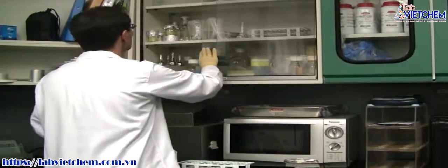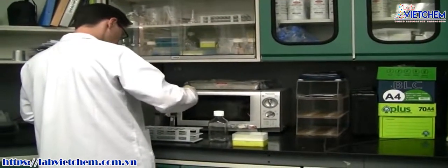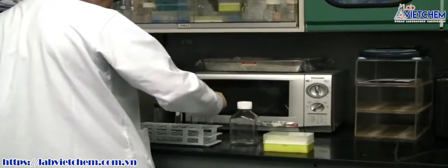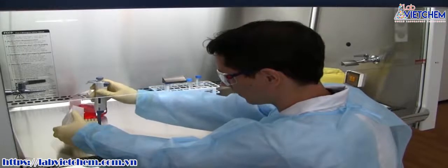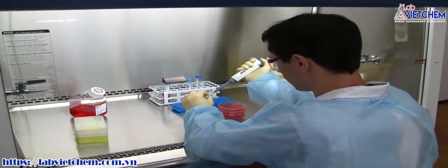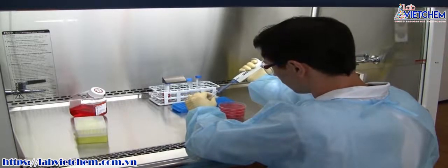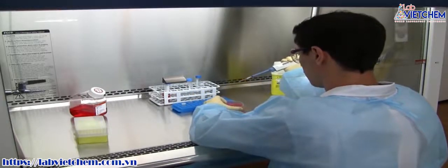In today's microbiological and biomedical research laboratories, procedures are conducted that can generate infectious aerosols and biohazards. These aerosols must be contained to protect laboratory personnel as well as the environment from exposure. Other procedures require a sterile environment with non-turbulent airflow so that cells and other cultures will not be contaminated while they're being handled. Both of these procedures can be performed safely in a biosafety cabinet using proper working technique.